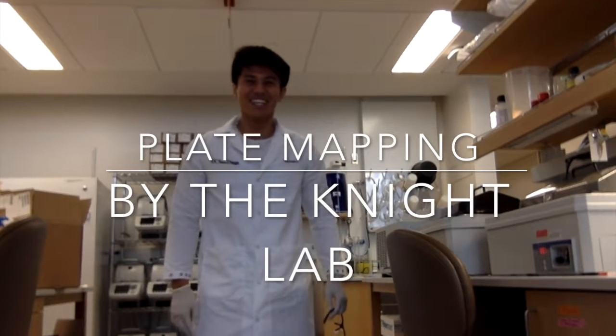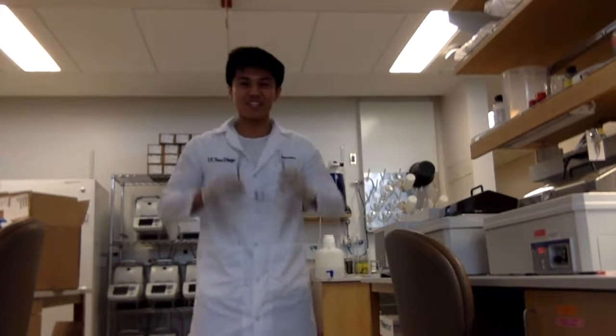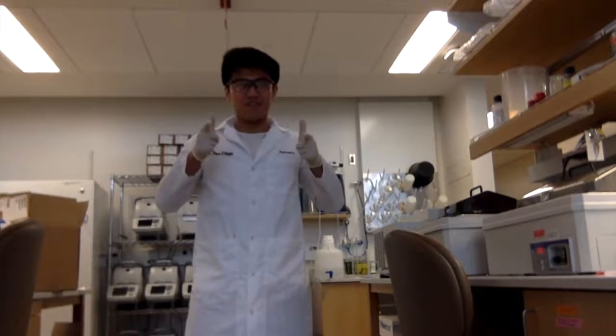Someone need a plate mapper? Step 1: BSI. Scene is safe. Let's do this. Step 2: Sterilize your work area with 70% ethanol.